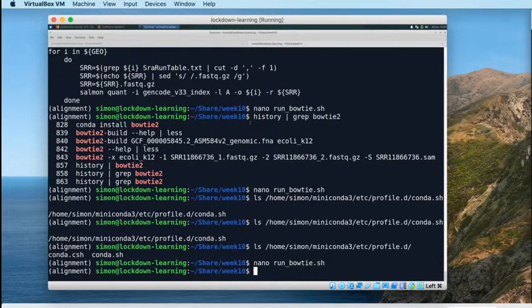Those reads therefore end up in the SAM file in the order they were in the FASTQ, which is a logical order in one respect, but a more logical order, which makes more sense to store things in in the long term, is the order that those reads fall on the reference genome. That's called coordinate sorting. So that's a coordinate sorted BAM file.